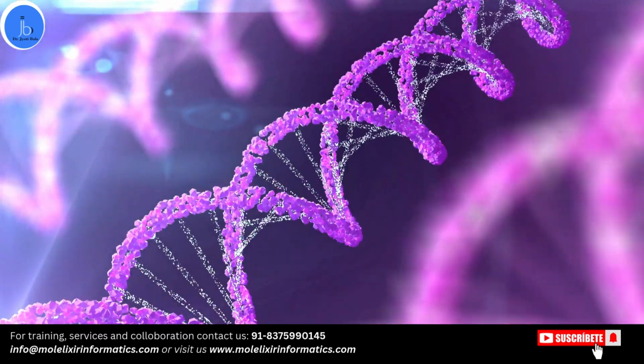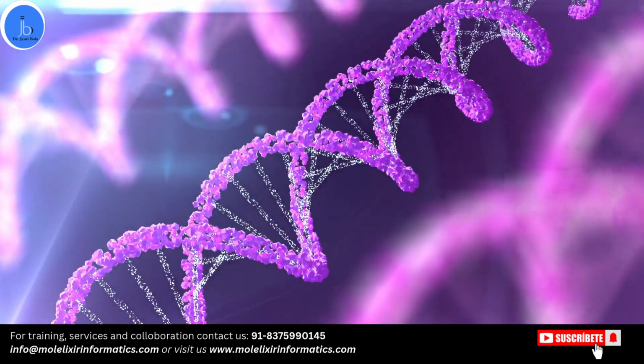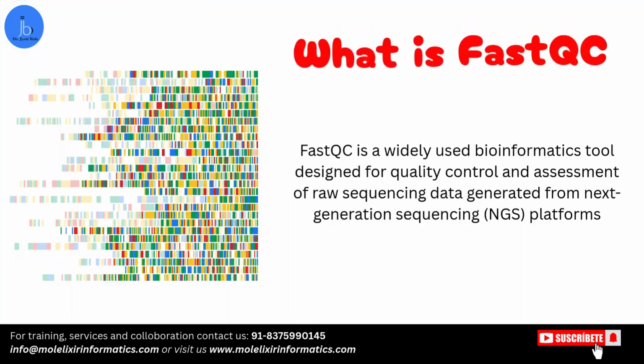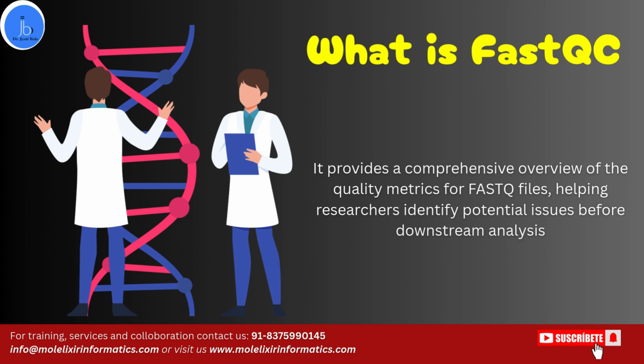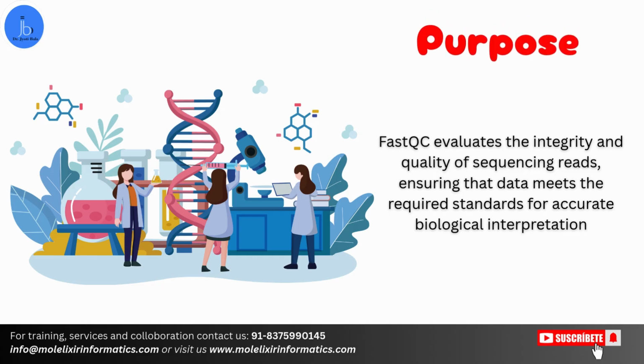FastQC is a widely used bioinformatics tool designed for quality control and assessment of raw sequencing data generated from next-generation sequencing platforms, that is NGS. It provides a comprehensive overview of quality metrics for FastQ files, thus helping researchers and data scientists to identify potential issues before downstream analysis. FastQC evaluates the integrity and quality of sequencing reads, thus ensuring the data meets the required standard for accurate biological interpretation.